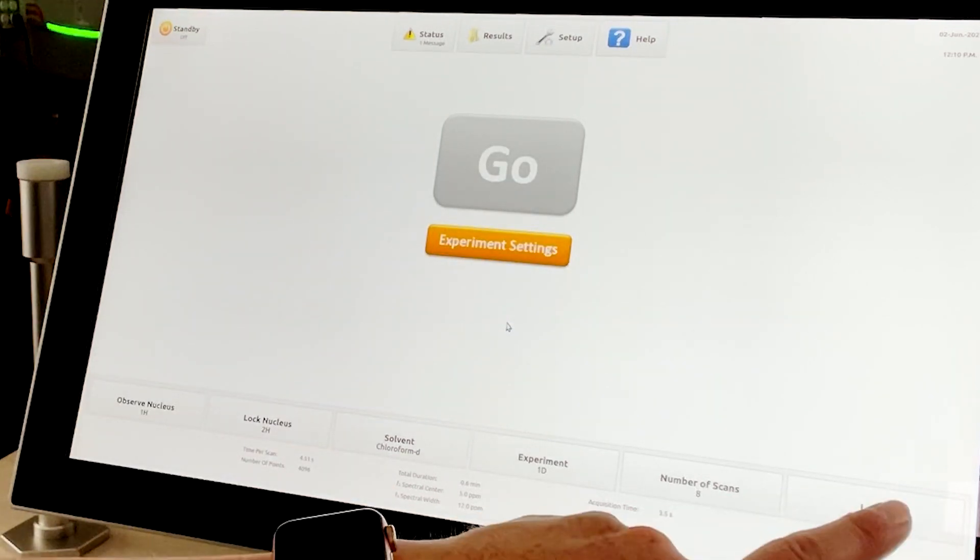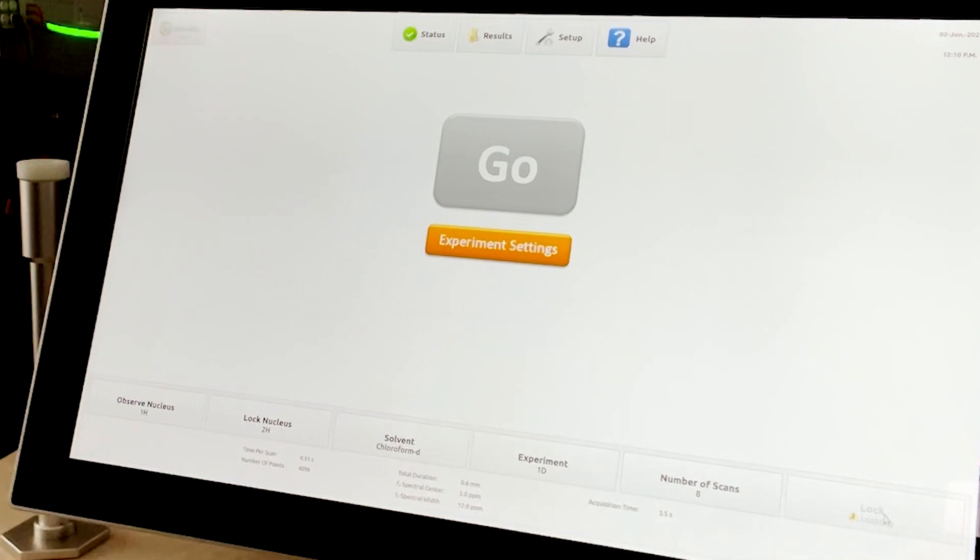This is done by pressing the lock button. Prior to selecting it, you will see that it reads Lock Lost.